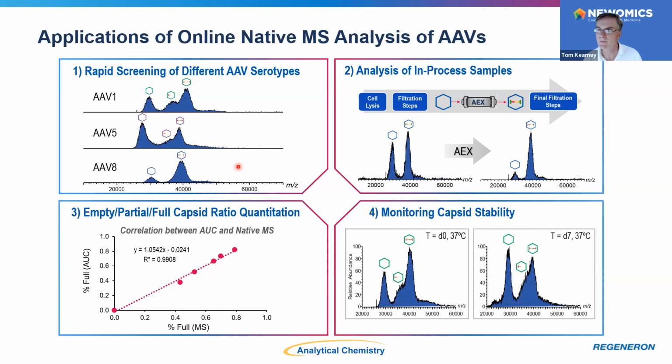What Orbitrap resolution did you use to collect these data? So these data were collected at low resolution because in our case, we found that high resolution doesn't really do any good for us, because these are such heterogeneous samples. So in order to maximize our duty cycle here, we just used low resolution. Okay.